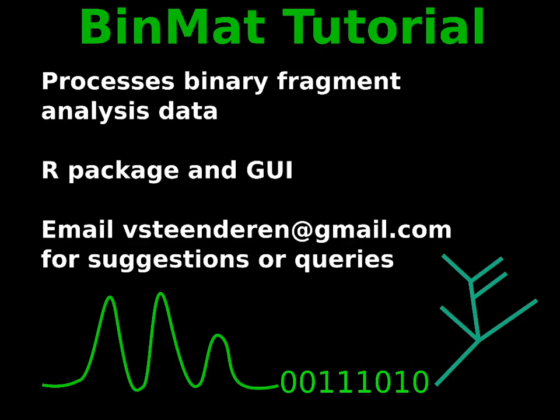Hello R peeps, this is a BinMat tutorial for the R package called BinMat that I created to help with the analysis of fragment data such as that obtained from ISSRs and AFLPs.